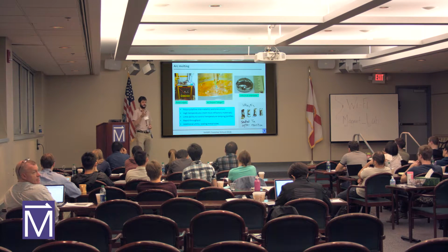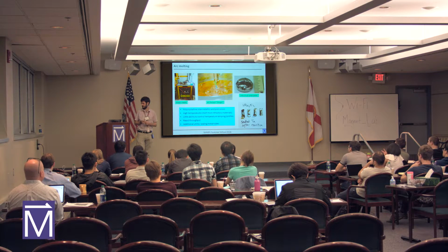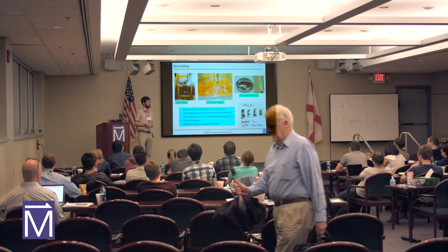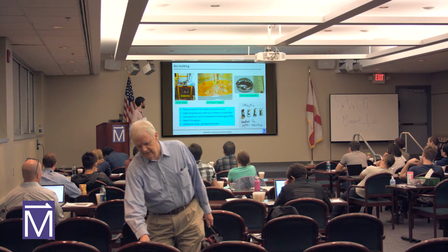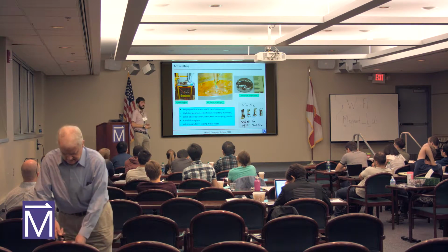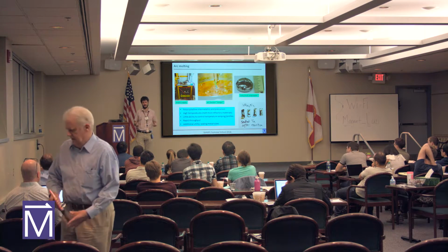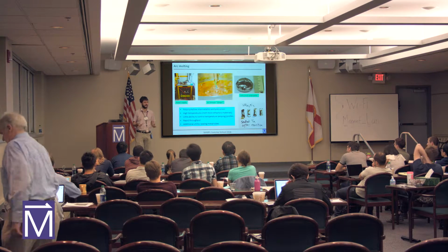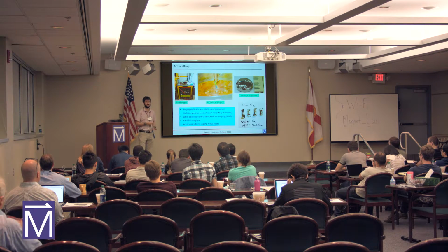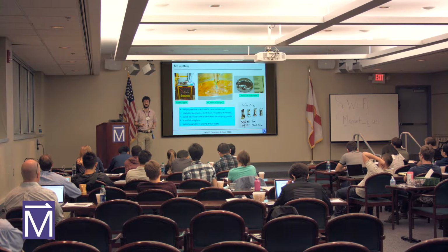So another way to produce polycrystalline materials is using arc melting. This is also very straightforward. First of all, this is used for producing polycrystalline intermetallics. Where the shake and bake might be good for oxides that you couldn't melt with an electrical arc, this is good for metals where you can drive a current through them and actually put them into the liquid state.